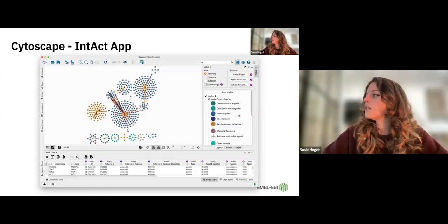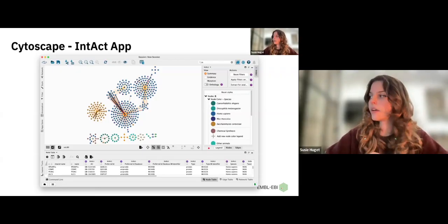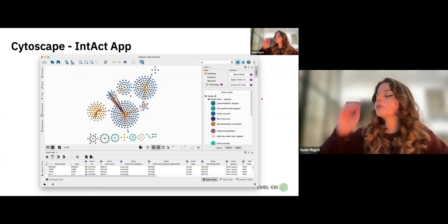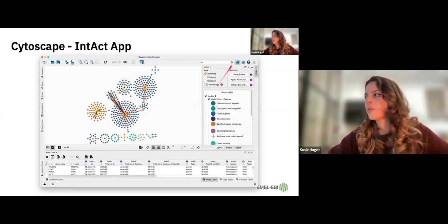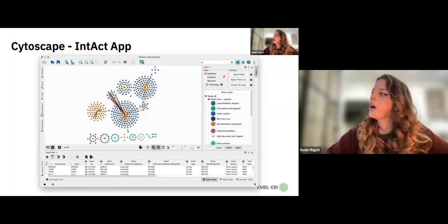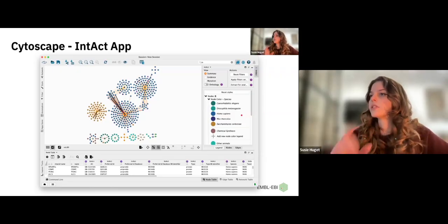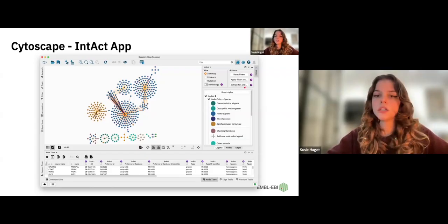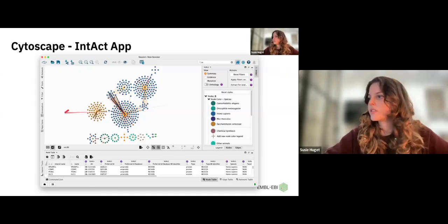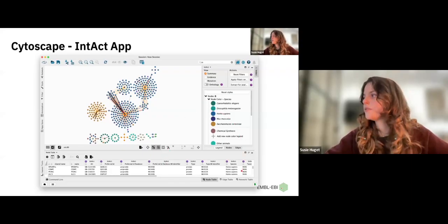Then on the right side, you have everything related to the view, the filters and the different legends related to the network. We will come back to the view part later. You also have actions here, so you can reset the filters, apply the filters on different networks. And also the extract for analysis button, which basically duplicates the network, so you can keep this one, for example, this way and work on another network if you want to add some stuff, move some stuff.